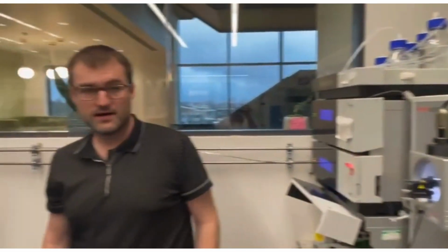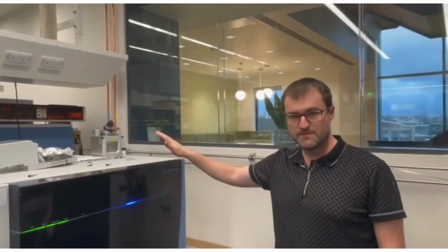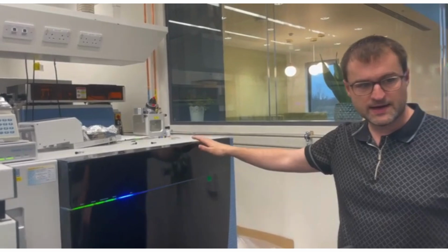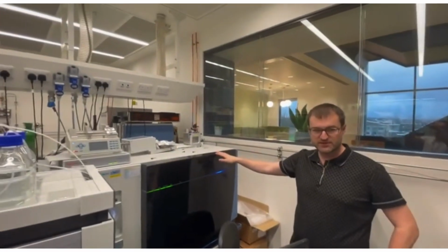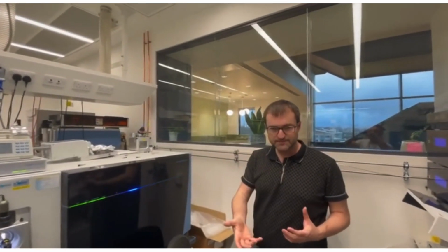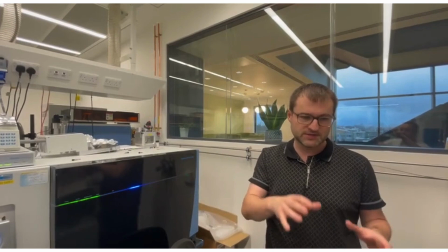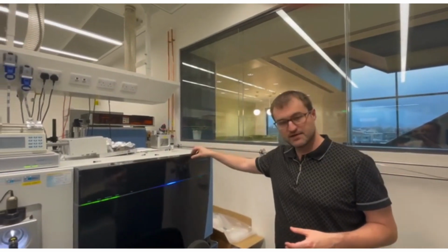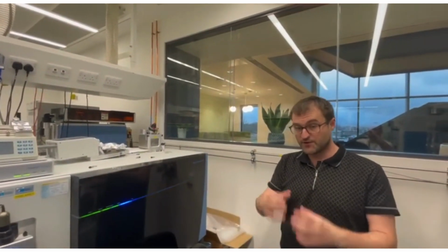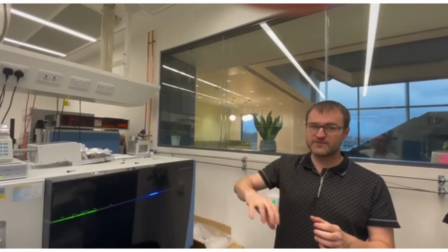Then finally, talking about price and complexity, this is the most complex mass spec we have, because it features what is called an ion trap. All the mass specs here have the capability to isolate and fragment ions, but this device can isolate a particular ion, a peptide or a metabolite, fragment it, break it into pieces, then isolate a fragment and fragment it again.